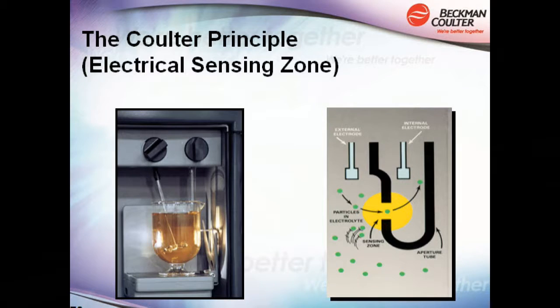So in the final dance between the particle and the instrument, it has passed through this sensing zone and been detected and counted and sized simultaneously. So the instrument actually counts every particle that passes through the aperture. So it's a quantitative, high-resolution particle sizing instrument.